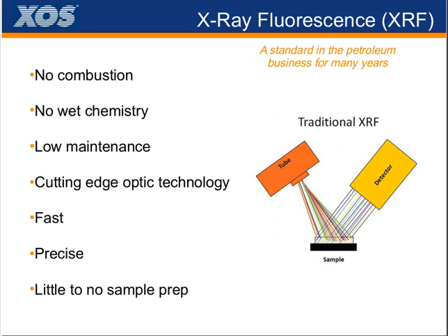You know, originally it was probably more prevalent in a research lab, and then it became an option for refinery labs and test labs. And then at some point, over the last 10 or 20 years, 25 years, XRF became something more commonplace even at the terminal lab, where you have a less trained operator. So the benefits of XRF: no combustion.